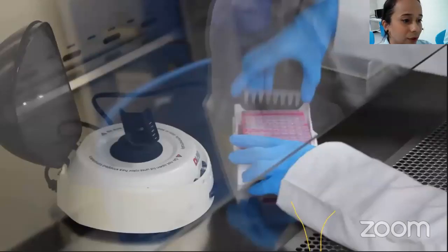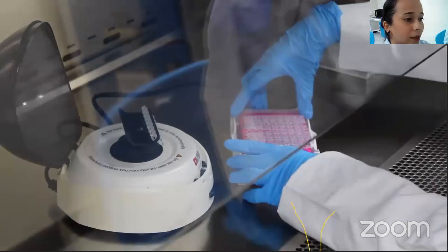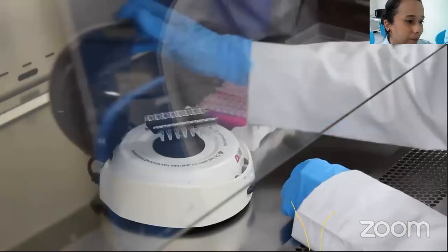Now we have covered the strips with the caps, and now we are doing a mini spin to settle all the reagents into the wells.